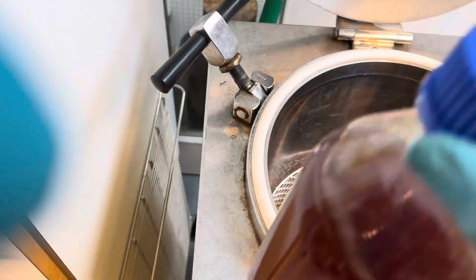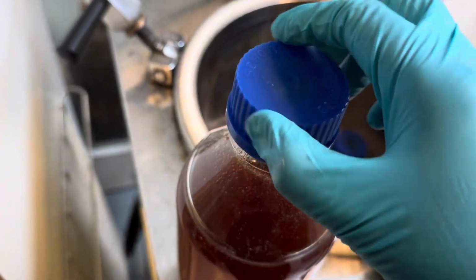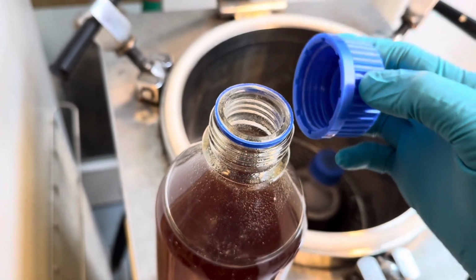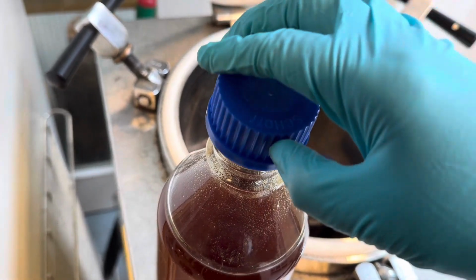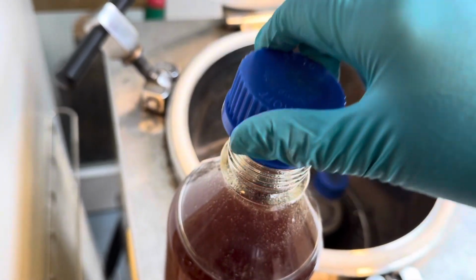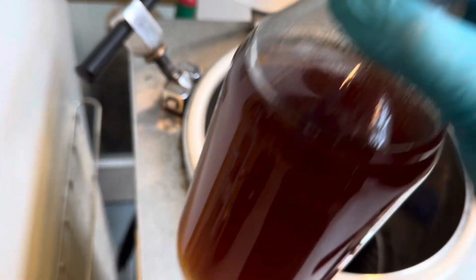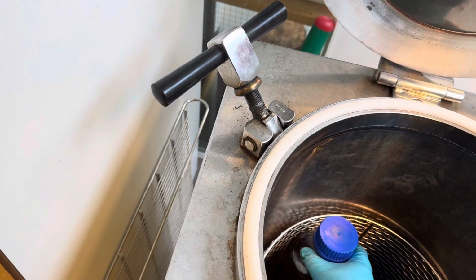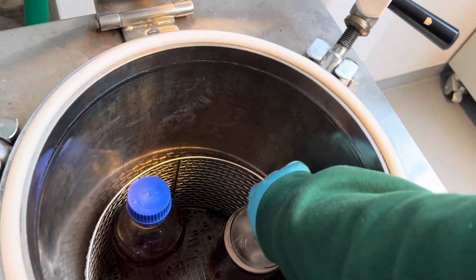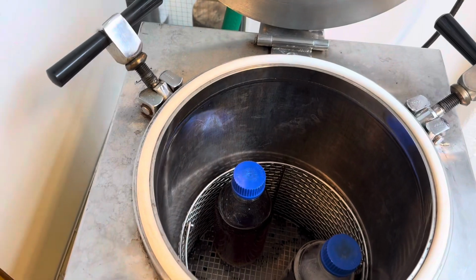So let me open them a little bit. They should be loose, not so loose that they will be taken out with the pressure of the water, but just a little bit. Okay, now it's good. We will place it here, and we will do the same thing with this bottle. Alright, so now we will close the lid.